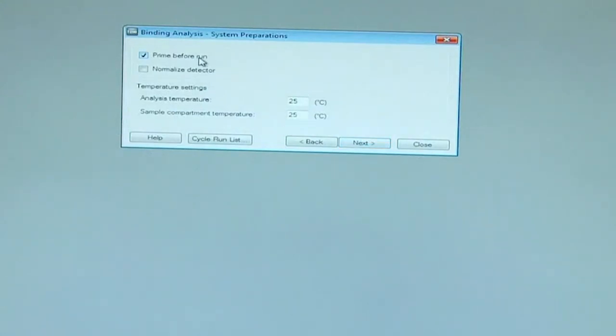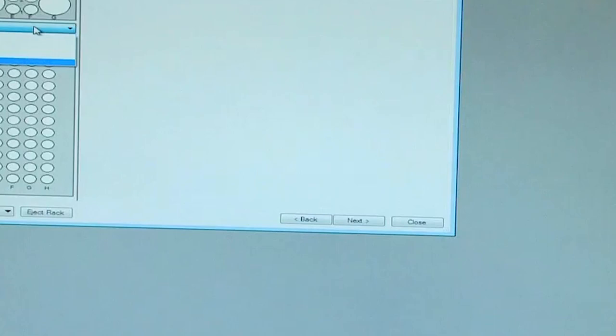And we will go to the next tab. We will select prime before run. And normalize is not required here because the chip is already immobilized. And we will go with the default temperatures. And we will go to the next tab. Here, we will not select a micro title plate. And this is our rack positions for a binding experiment. Here, we have at the C1 position HBS EP plus buffer for three different startups. We have three concentrations of analytes: high, medium and low. And we have the regeneration solution here, which is 10 millimolar glycine pH 2.5. And we will prepare our solutions and start the binding experiment.